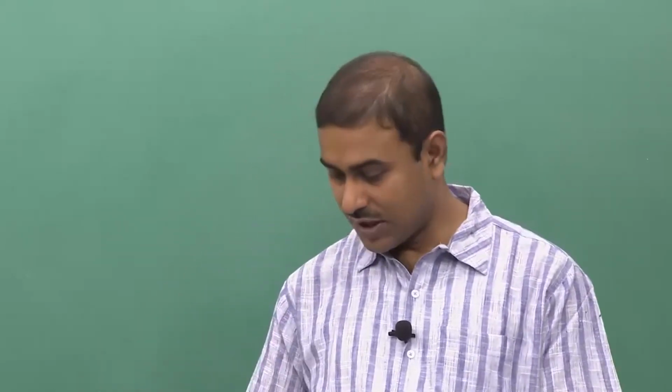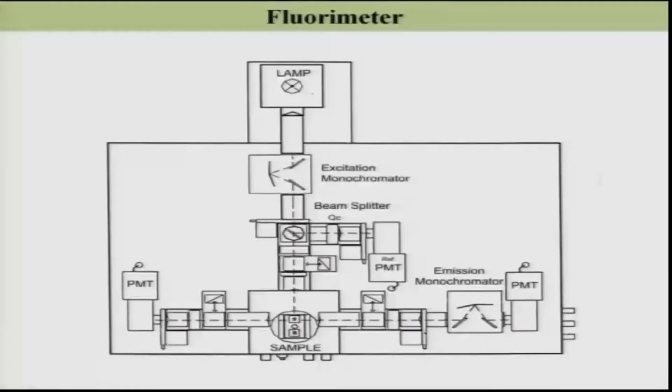Simple emission spectra means without that correction file, but we should report the corrected emission spectra. Let me show you the modern fluorimeter. This is the modern fluorimeter, right. I have this lamp, let me change the color.